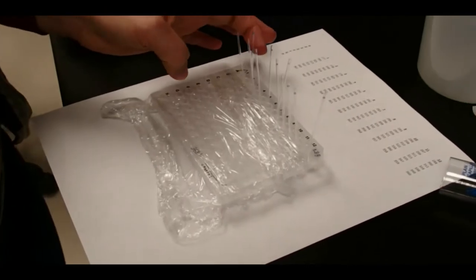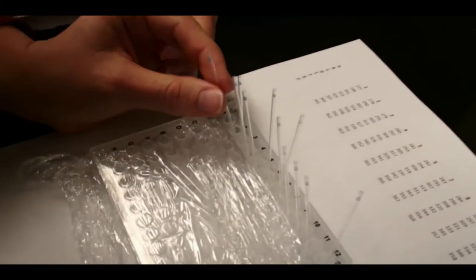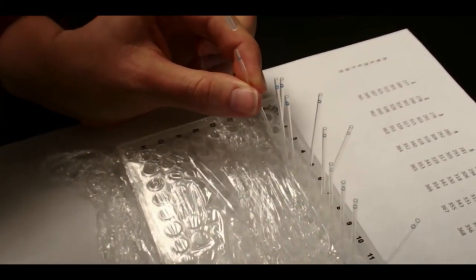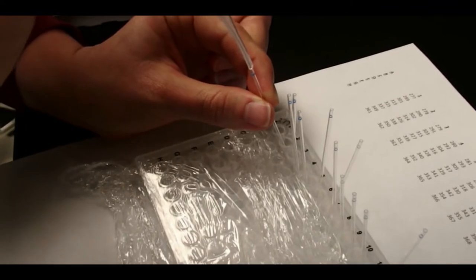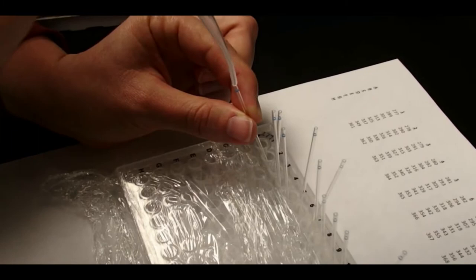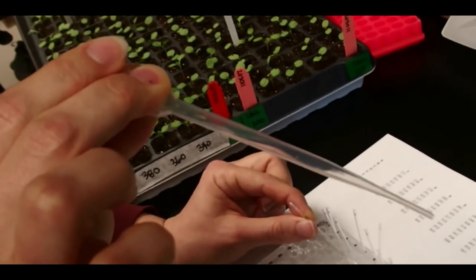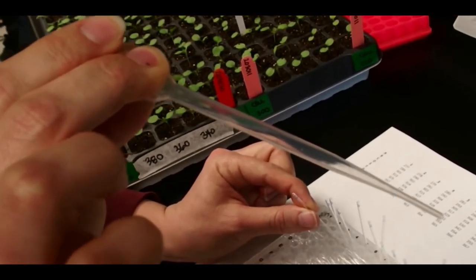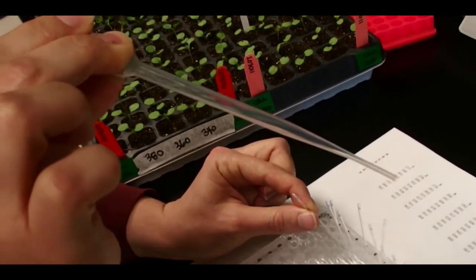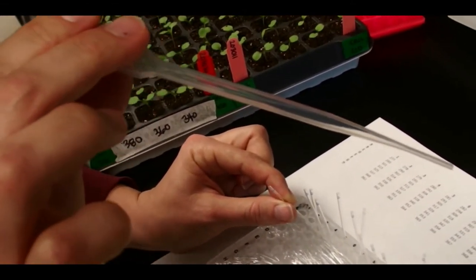Okay. The important thing is now not to suck stuff into the capillary. It's rather to blow it out. So again, out of the liquid just slightly, attach it on and blow gently until the disc comes out. If you squeeze your fingers on the thing, do not release your fingers, because that will suck up while you're on the capillary tube. If you want to release it, take it away from the capillary tube to release the suction.